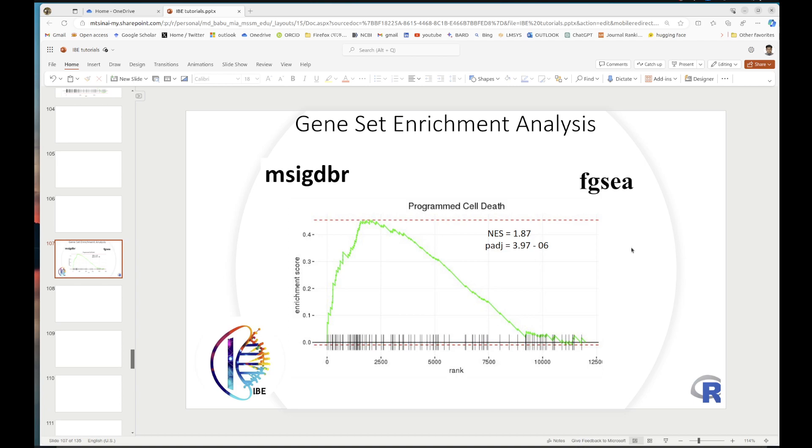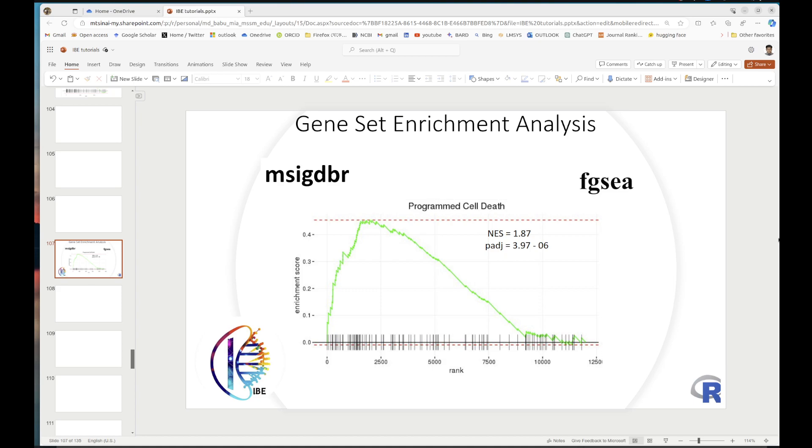One of the ways we analyzed earlier is downloading the GMT file from GSEA and running it locally - that's one sustainable way. For instance, if you want to run a lot of them and use the entire GSEA datasets to compare multiple at a time, how do you do it?